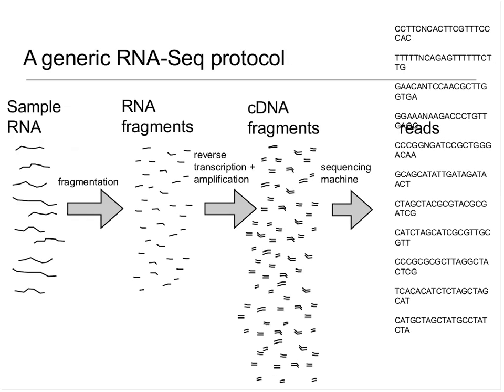The slide is a little bit garbled in the transition from Mac to PC, but the cDNA fragments are then fed into the sequencing machine, which typically can only handle DNA, and it outputs a set of short reads. They're typically on the order of 35 to 150 base pairs long that are derived from the ends of these cDNA fragments. Okay. Can you send me these numbers?